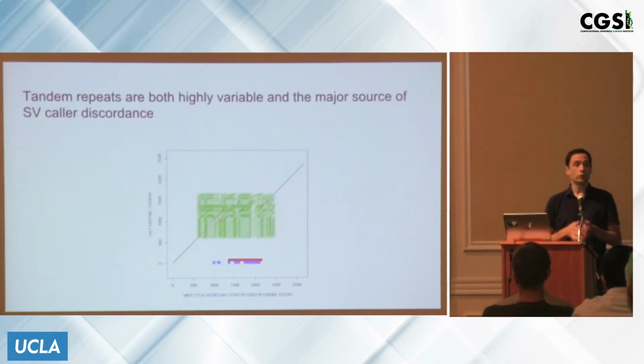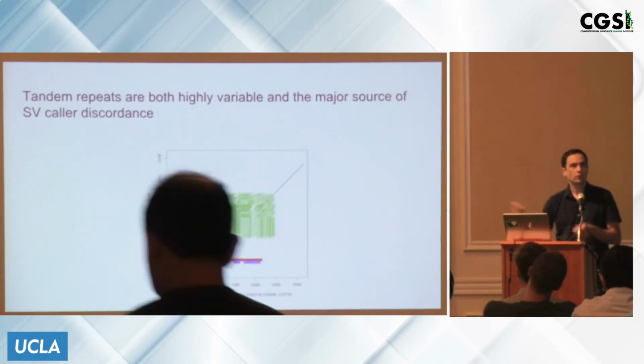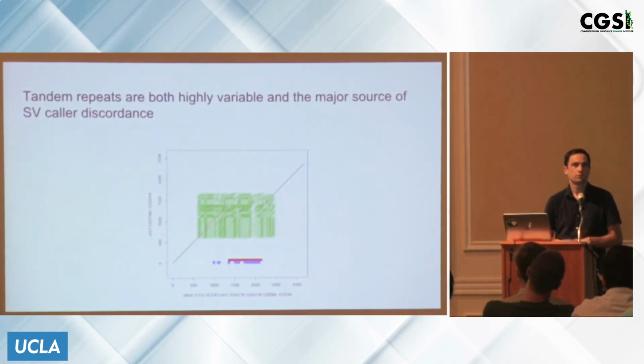Like I said, you could look at the information content involved in 150 bases of an 85% accurate sequence and show that the information is relatively low compared to the scales of the length of the sequence. But the key is that it becomes very difficult to solve that mapping problem in duplicated regions, which tend to be the regions that have the variants.